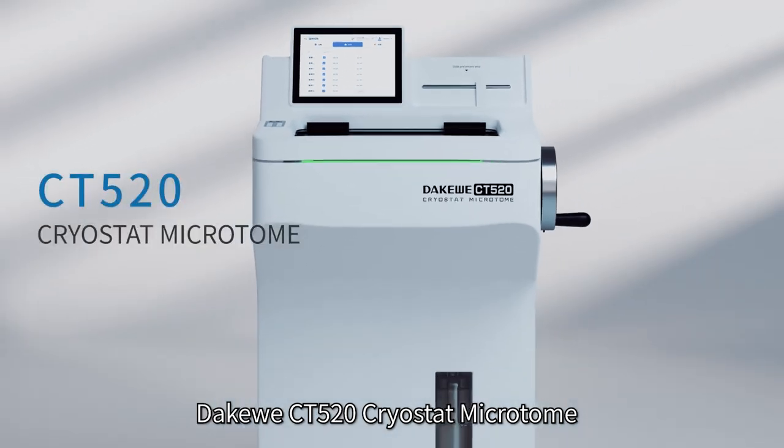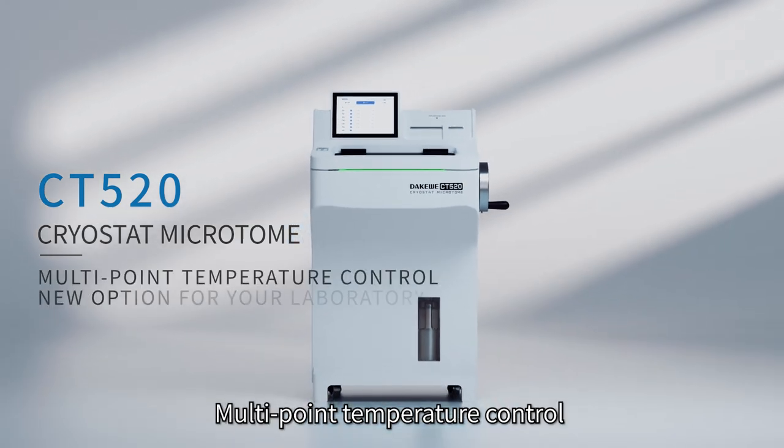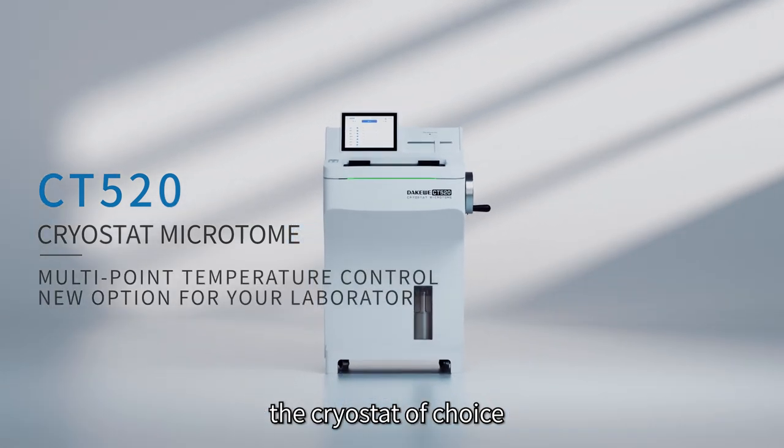DAKAWAY CT520 cryostat — microtome, multipoint temperature control, the cryostat of choice. DAKAWAY, bettering human health.